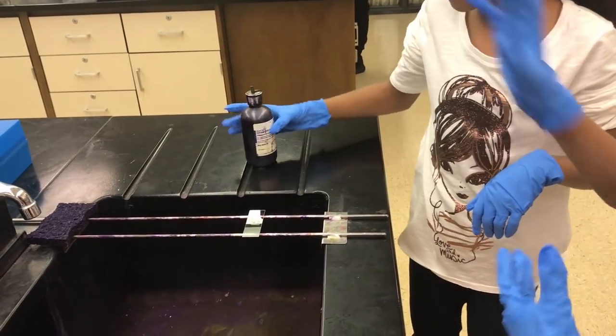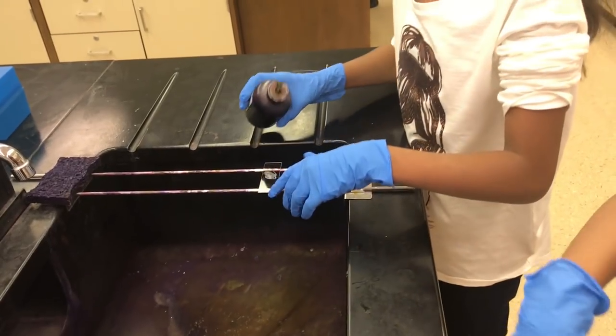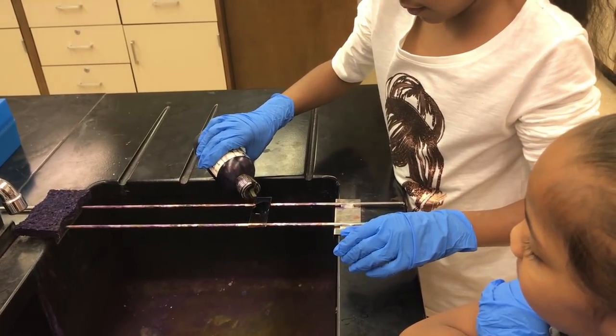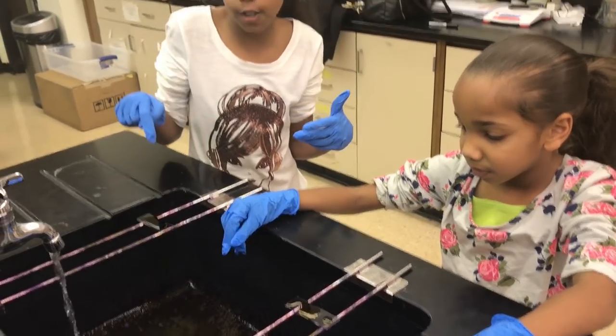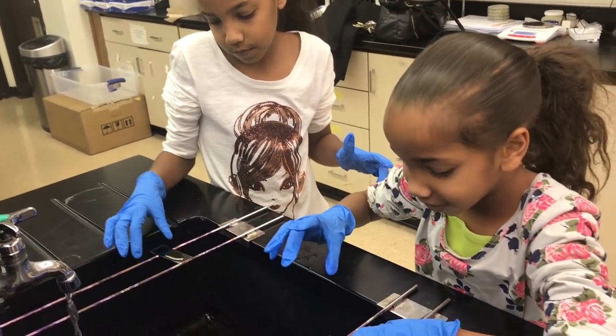Okay, there we go. Now we have to pour it onto the slide. Pour it onto the bacteria. Just squeeze it on, so it covers the circle. Okay, your turn. So now to finish this, we're just going to put it inside the water and rinse it off.